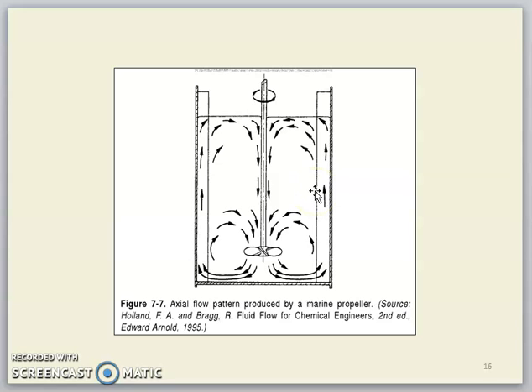This is the axial flow pattern produced by a marine propeller. Okay, axial, you can see here, from bottom to top, and return back to the bottom of the vessel.